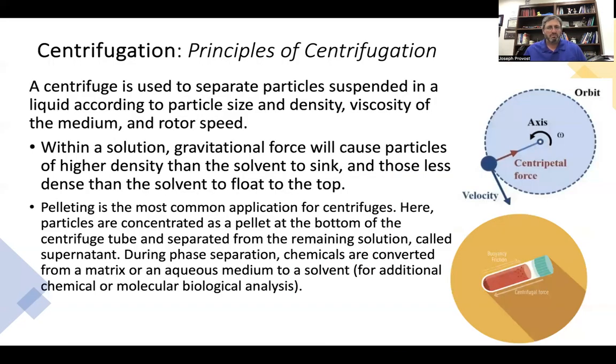So the principles of centrifugation, hello physics, pretty straightforward. As your sample starts spinning, it creates a centripetal force that creates enough velocity where you're creating a temporary increased gravitational force on these particles. You can pellet down more dense materials from materials that are in solution, proteins in solution generally, without adding high salts and things like this, are going to stay in solution where a broken cell, let's say bacteria cell or a cell culture cell, the mitochondria, the cell membranes, the endoplasmic reticulum, the nuclei will all centrifuge down depending upon how long and how hard you centrifuge your tubes.